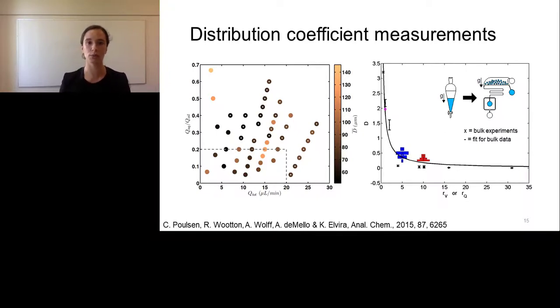And then on the right-hand side of this slide, as the little image on the top of the graph shows you, we are comparing the shake flask method, the traditional method, with our microfluidic method, and showing that the data is comparable to our bulk experiments, but also to the literature. And you can see that when we plotted the data for our experiment, which are those 2 violin graphs in blue and red on the slide, because we detect individual droplets, we actually get huge amounts of data for each data point compared to the bulk system.